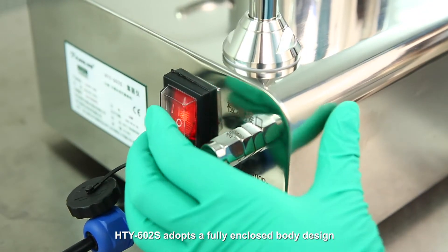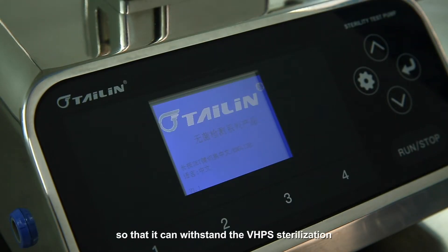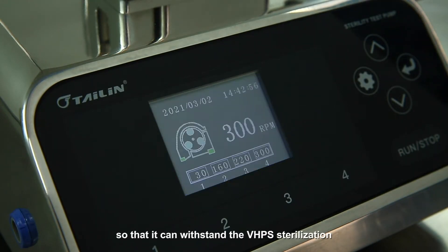HTY602S adopts a fully enclosed body design so that it can withstand VHPS sterilization.